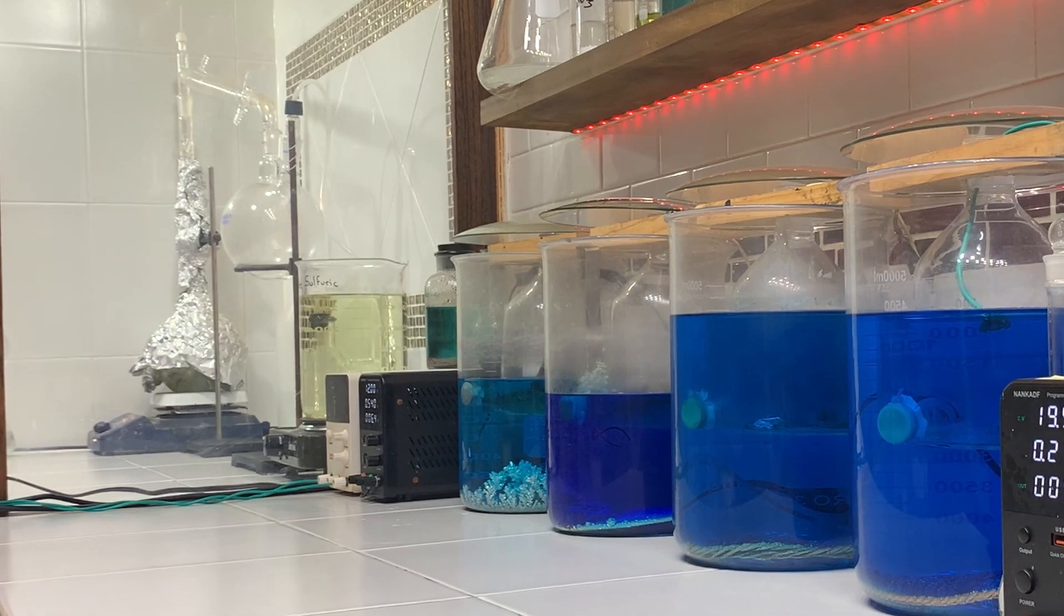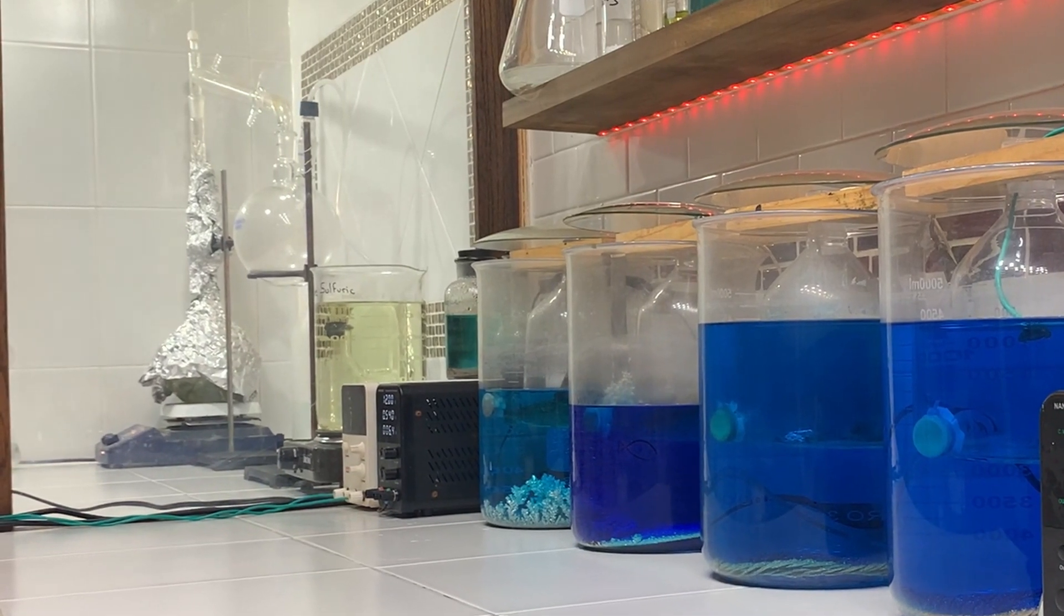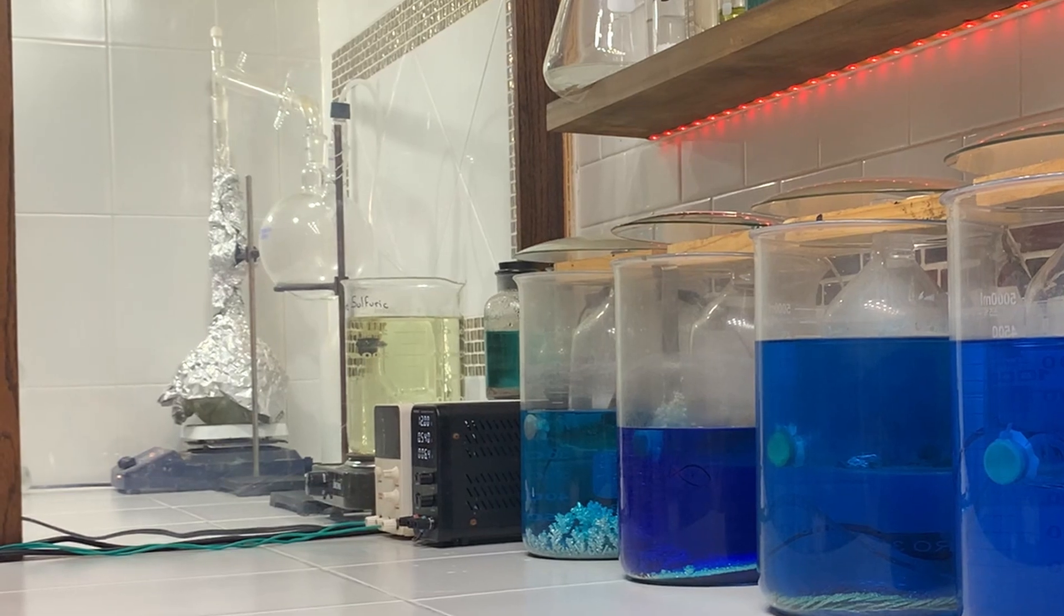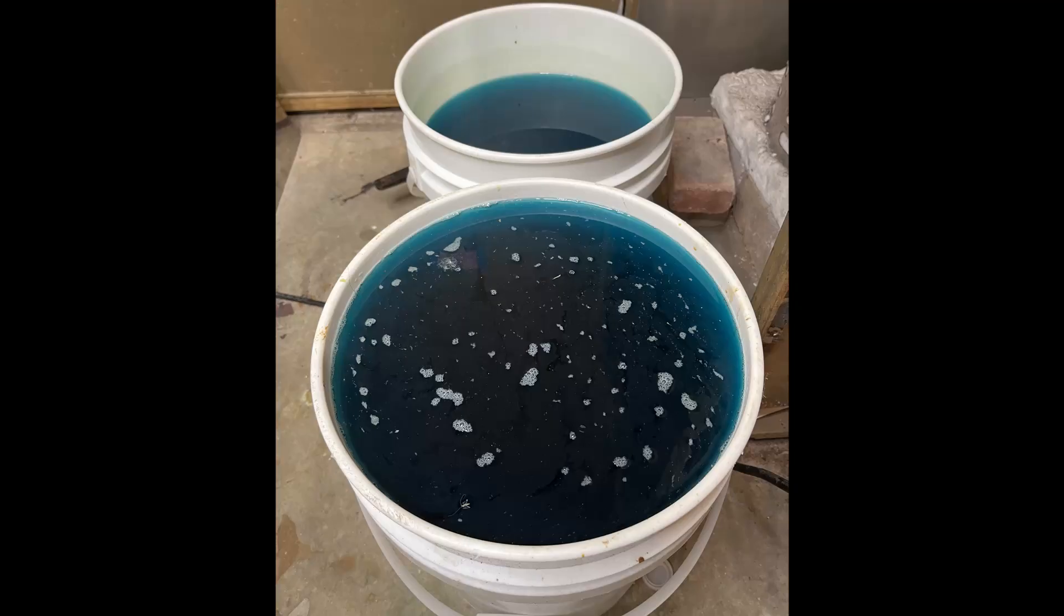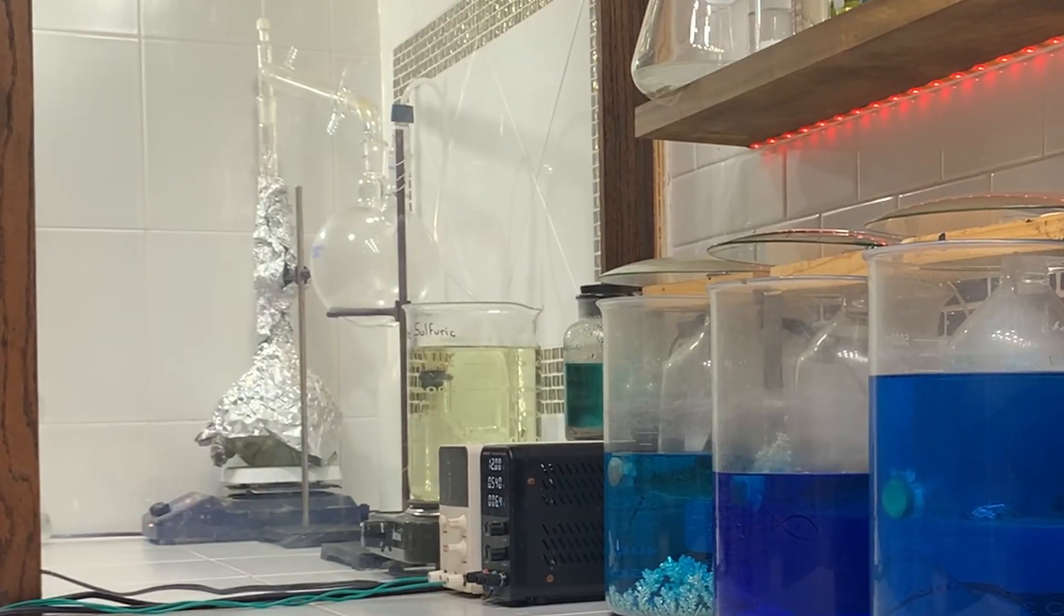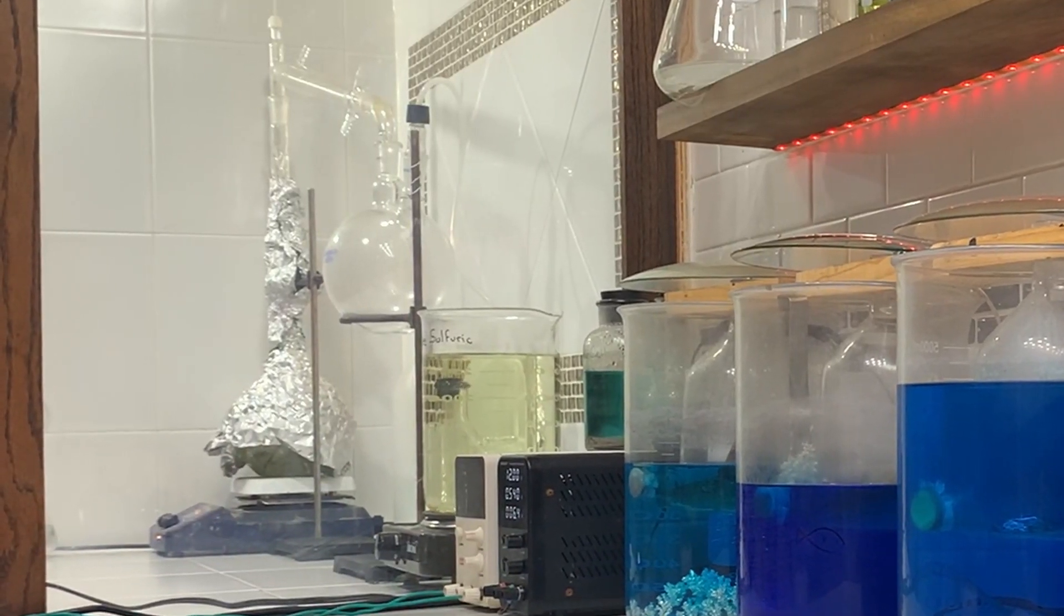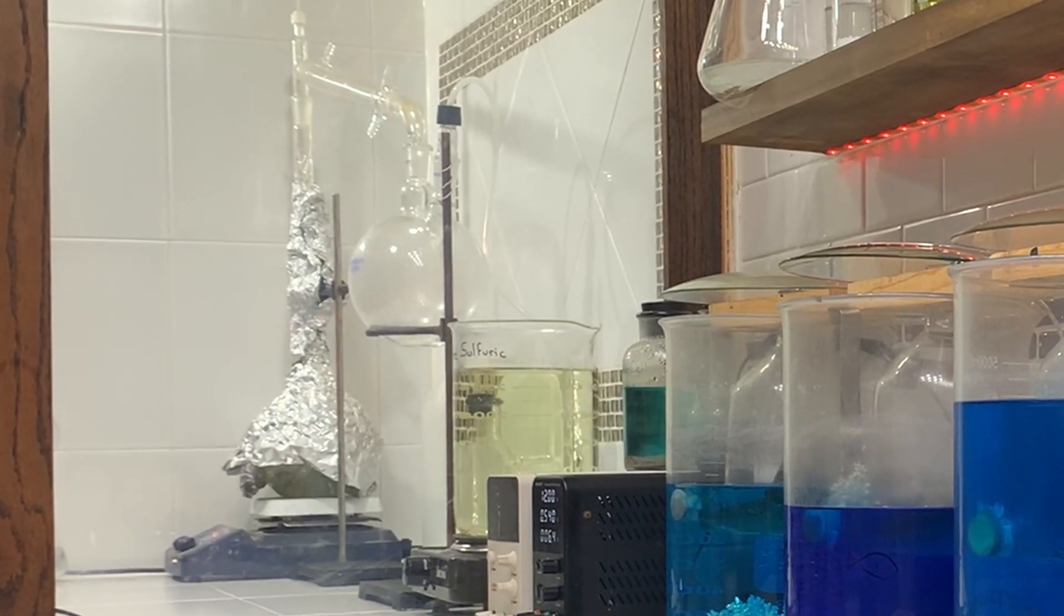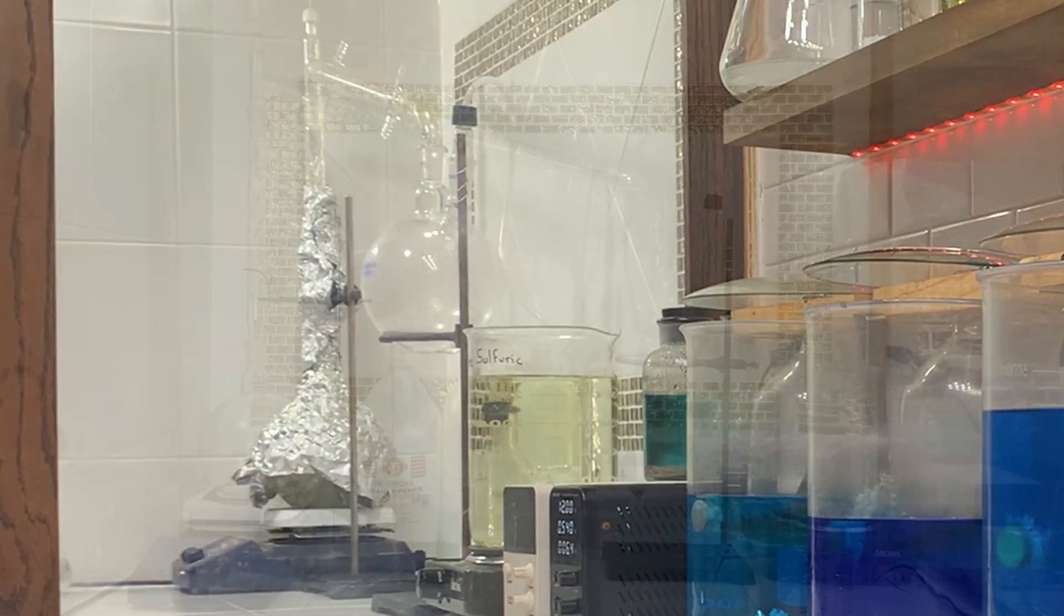Welcome brothers and sisters. In today's experiment, I'm going to explain the results from part one on how much nitric acid was recovered from distilling one full five-gallon bucket of copper nitrate solution from the silver cells. I'll also explain how long the process takes and discuss a couple of the issues I ran into along the way. So sit back and enjoy the video.